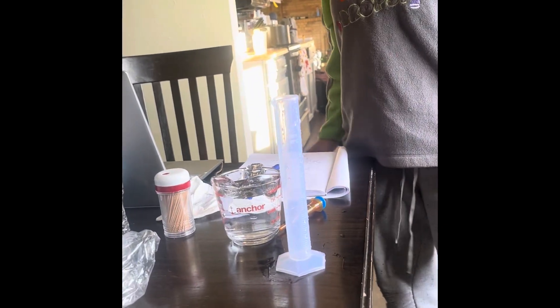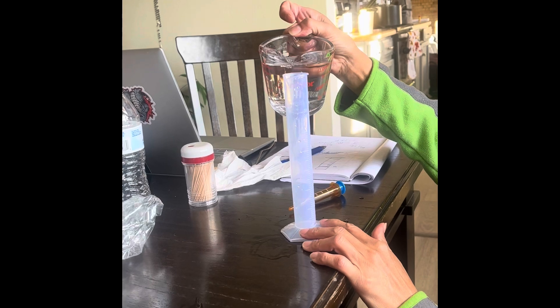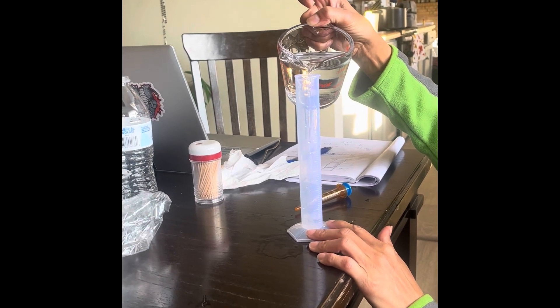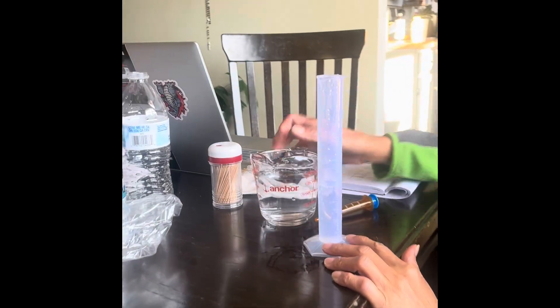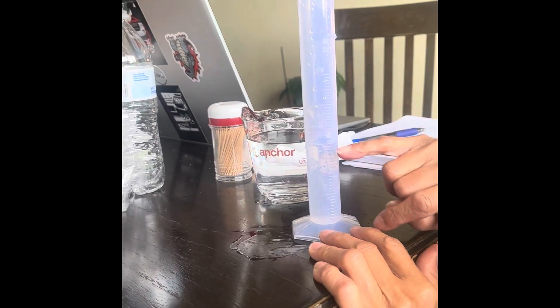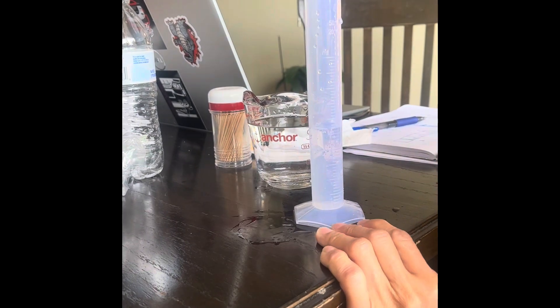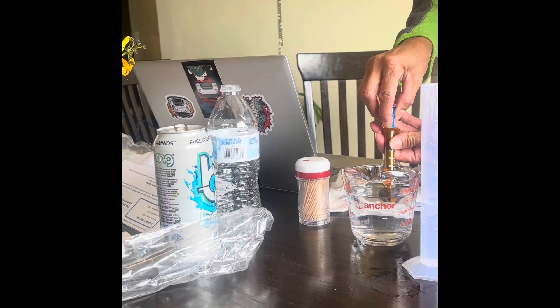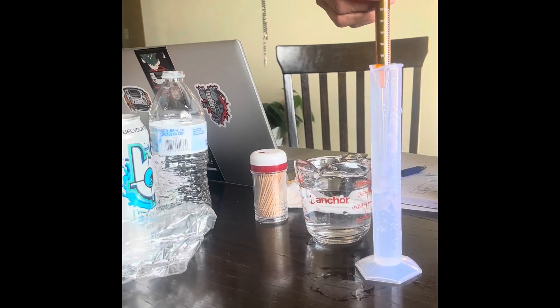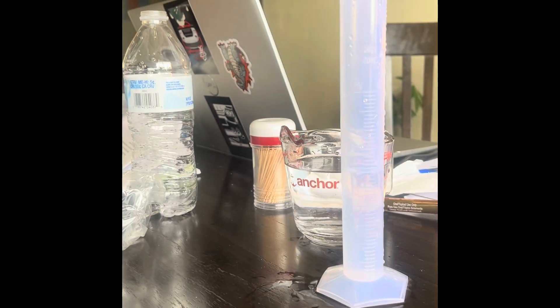Now I'm going to do 28 milliliters. So I'm going to do 18 milliliters.